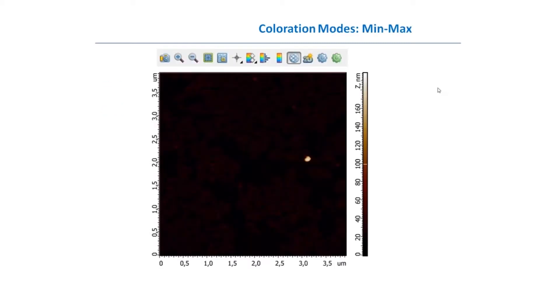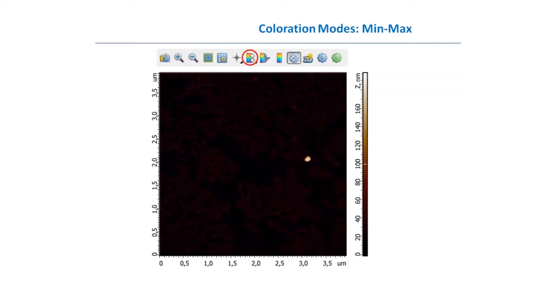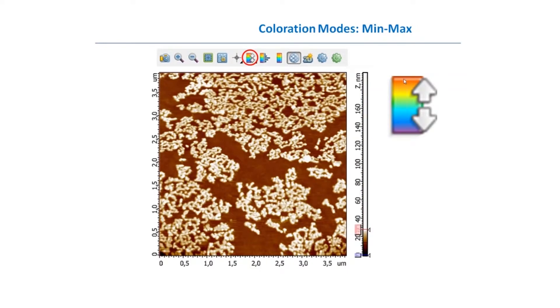Again, this example with a big particle — why is this image not informative? This happens because the big particle takes up most of the coloration gradient. There are several ways to overcome this.